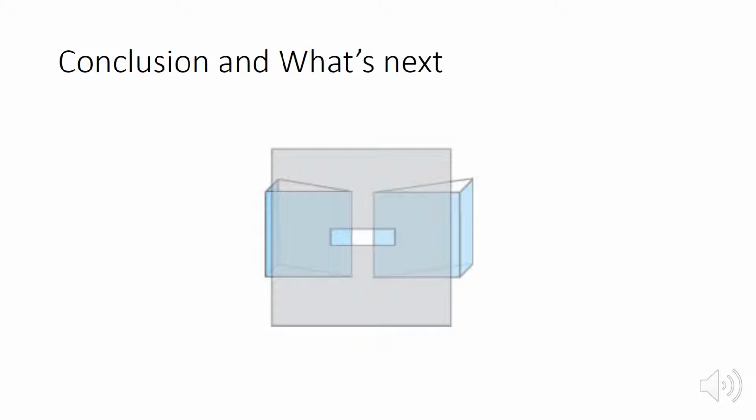In conclusion, the authors of this paper believe that the virtual core flow cytometer was able to greatly simplify a once complex system requiring large amounts of sterile sheath fluid into a technology that is based on a PSD creating a virtual core and less of a requirement of using sheath fluid. This makes their new approach more applicable to field laboratories, such as in oceanography or more environmentally geared research.